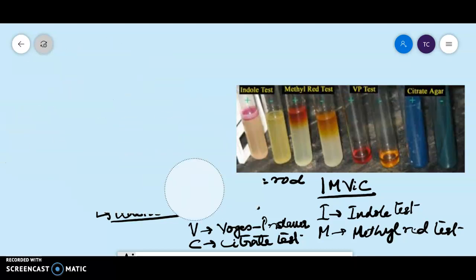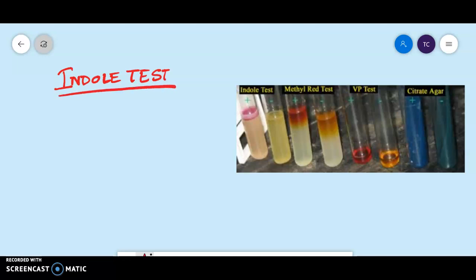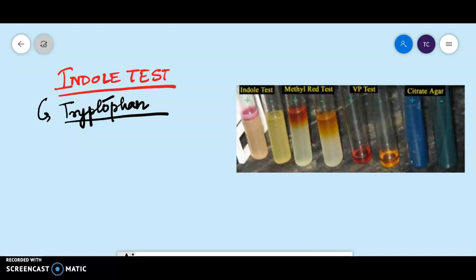Next we will move on to the Indol test. We will discuss the tests one by one. So first in this video we will be discussing your Indol test. The organism under consideration is grown in peptone water broth. The basics of the Indol test: it determines the ability of the microbe to degrade the amino acid tryptophan. So if you want to characterize your microorganism on the basis of its ability to degrade tryptophan, we go for the Indol test.